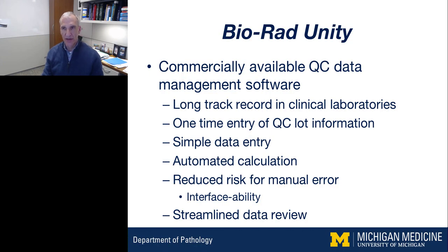So we have these spreadsheets for all of our quantitative assays, and all the data input is manual, as I mentioned, and all the review is manual. So the supervisors and our chief technologists are going into the computer and looking at each of these spreadsheets for all of our assays every day. And it is very time consuming and very cumbersome, and sometimes difficult to identify when problems are really arising or that there are trends that we should be paying attention to.